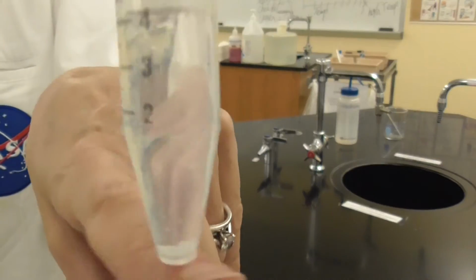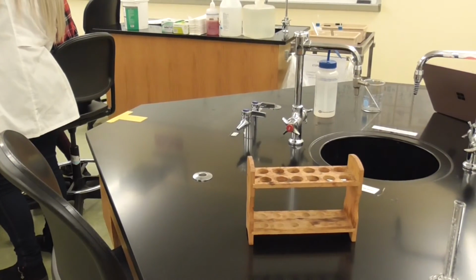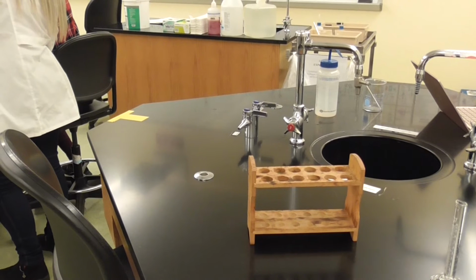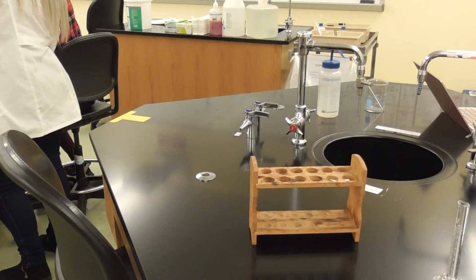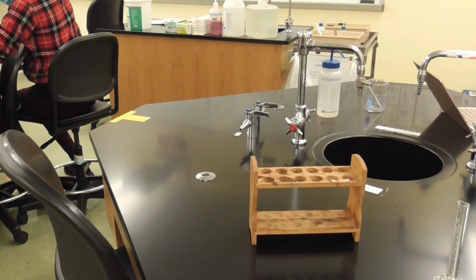All right. Still have some here, so I'll take it to the vortex. We are in the process of dissolving the caffeine in the centrifuge tubes because it is not 100% dissolved. So that's why we are heating it. Put it in a hot water bath. Give it some time to dissolve 100%.